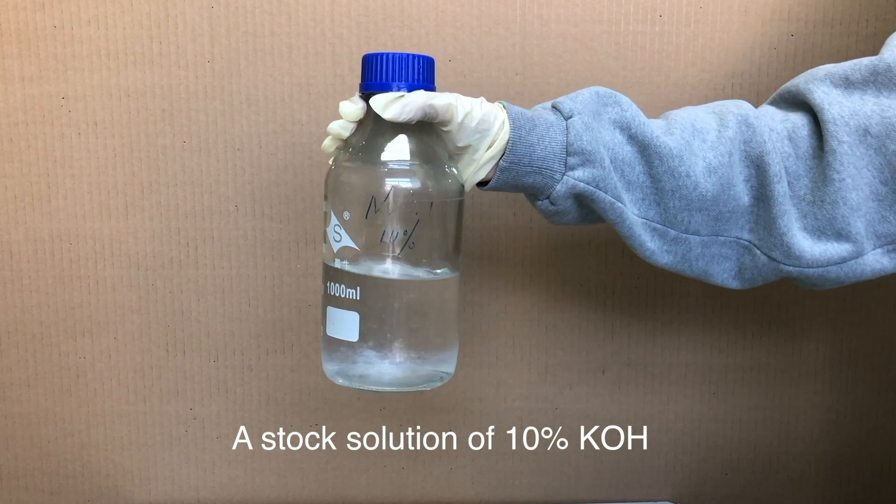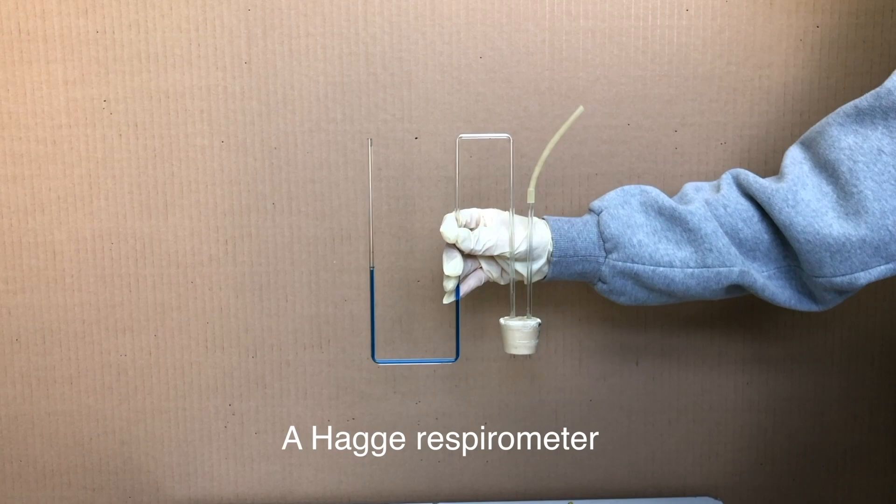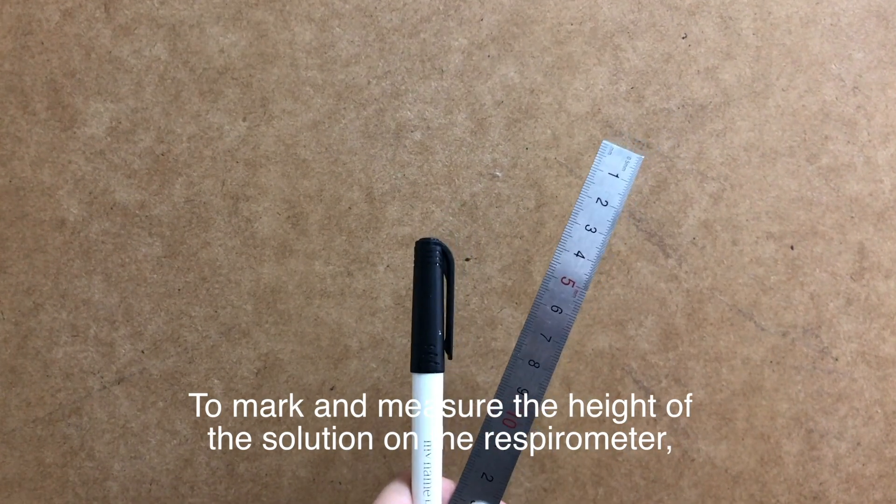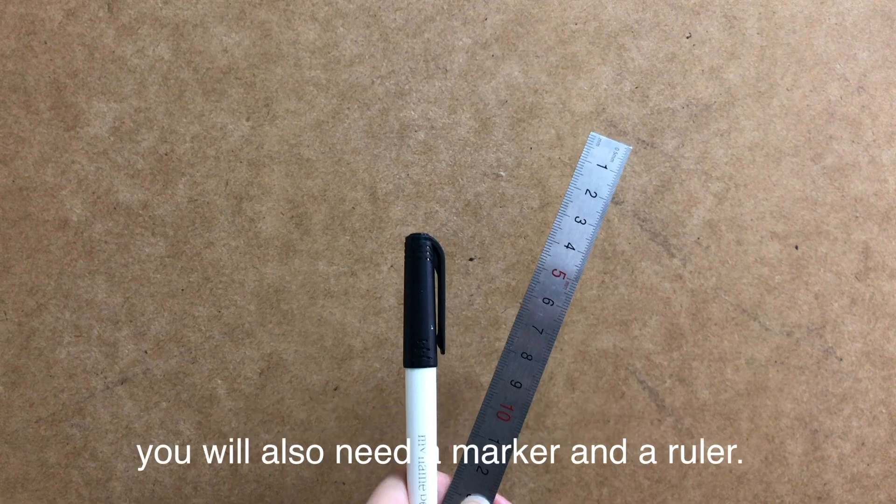You'll also need a stock solution of 10% KOH, a Hagi respirometer, and cotton. To mark and measure the height of the solution on the respirometer you will also need a marker and a ruler.